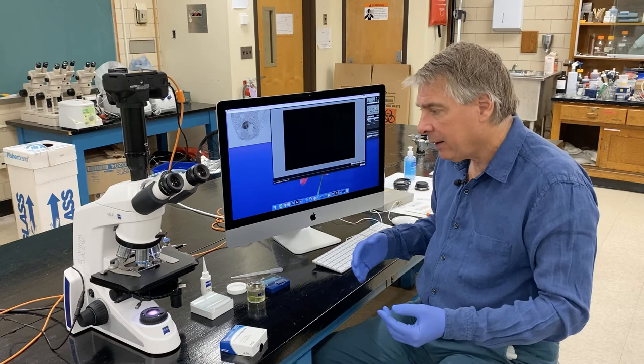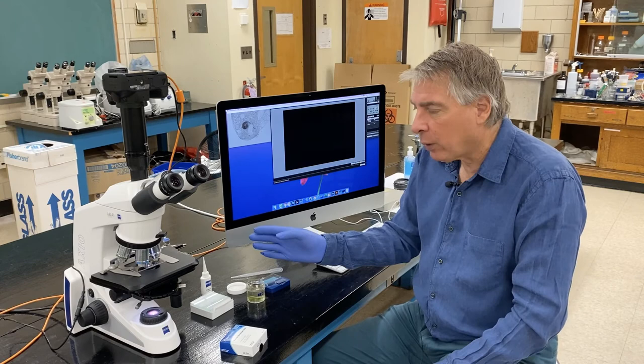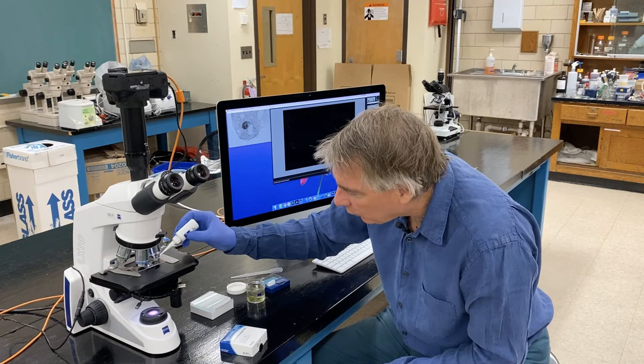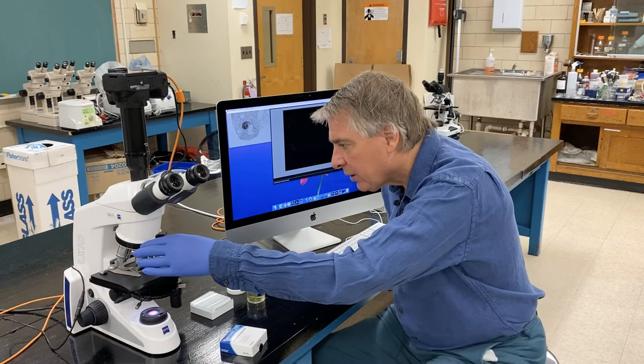If I want to shoot at lower mags, I don't want to have to shoot through the oil, and you don't want to go from the 100x back to the 40, because you'll swing the 40x back into the oil, and now you'll have oil on the 40x objective, which wasn't built to work with oil, and you'll have blurry images, and you'll have to try to figure out how to get the oil off of the microscope objective. Which is really just wiping it off with a very fine special paper, lens paper, that's designed for that purpose. So I put one drop of oil, and I'm going to swing the 100x objective in place.